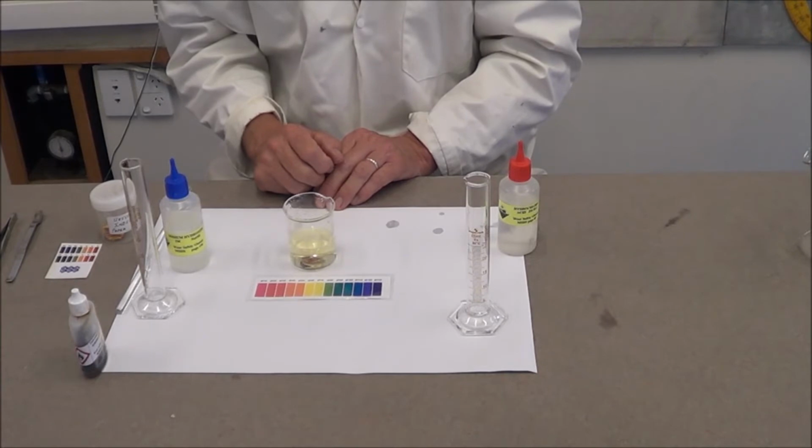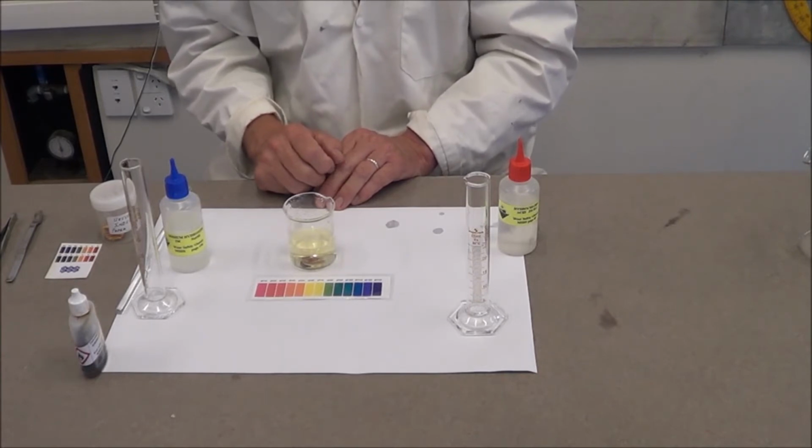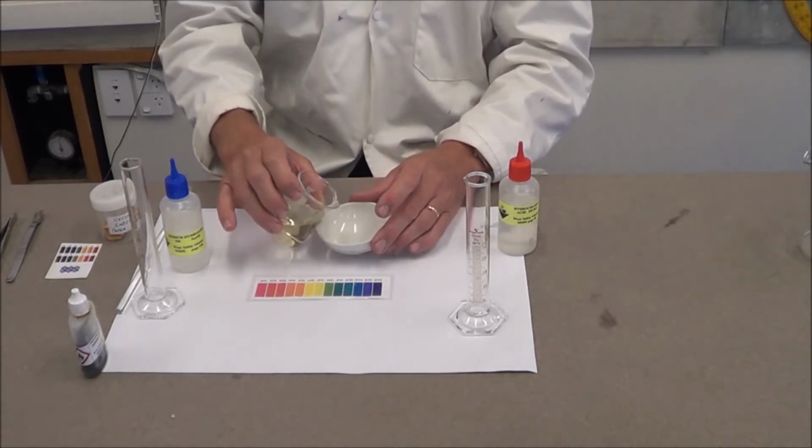To get our solid sample of the salt that's formed, we'll need to place this into a boiling dish and place it over the heat and boil it for 1 minute.